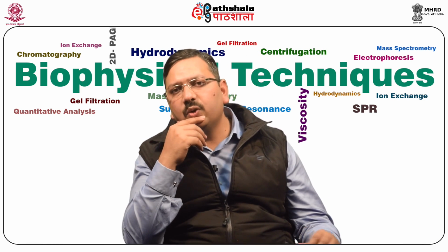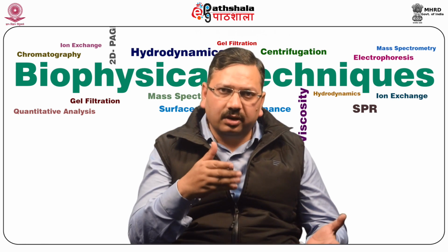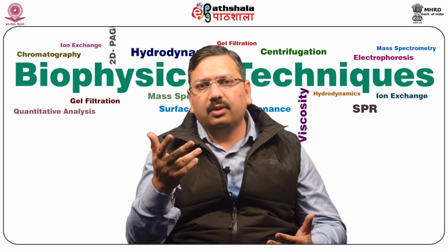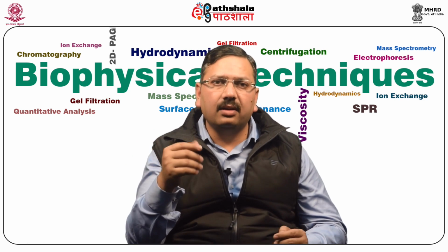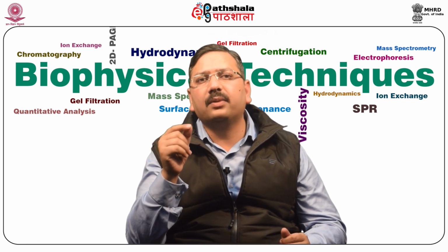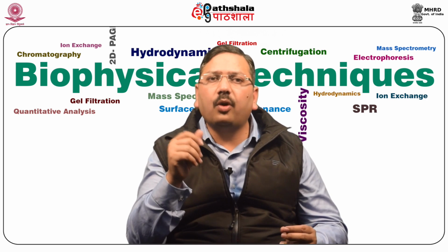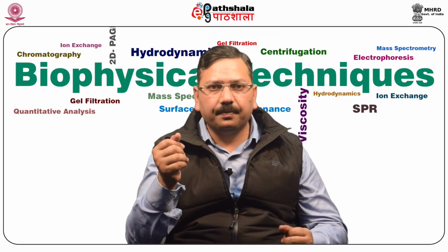Now coming to the next question: what is the mode of ionization, whether it is positive or negative? The answer comes from two cases. One is for proteins, another is for DNA. For example, if a sample has a functional group that readily accepts protons, such as an amide or amino group found in peptides and proteins, then positive ion detection is utilized, for example in proteins.